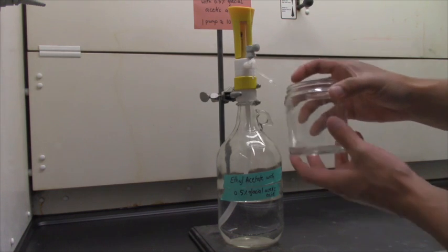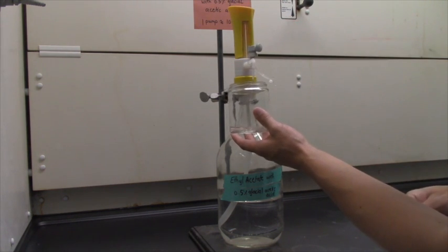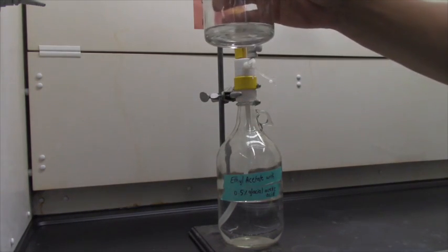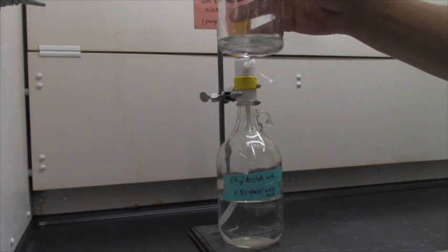You might need to add a little bit extra, so if you need to add just a little bit more to ensure that that bottom is completely covered, go ahead and just lift up a little bit and let go, and that will dispense 2 more mils or whatever you think that you might need.